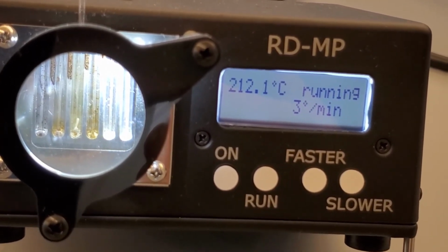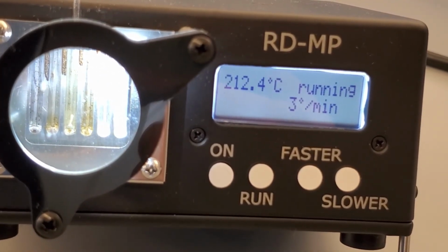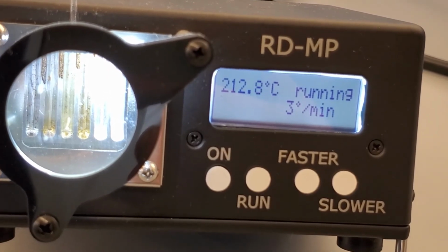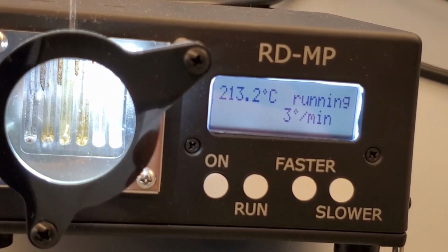We have officially surpassed the melting points of borneol and isoborneol and have not observed melting, and have a tiny amount of solid left in the tube. This leftover solid is most likely an impurity.